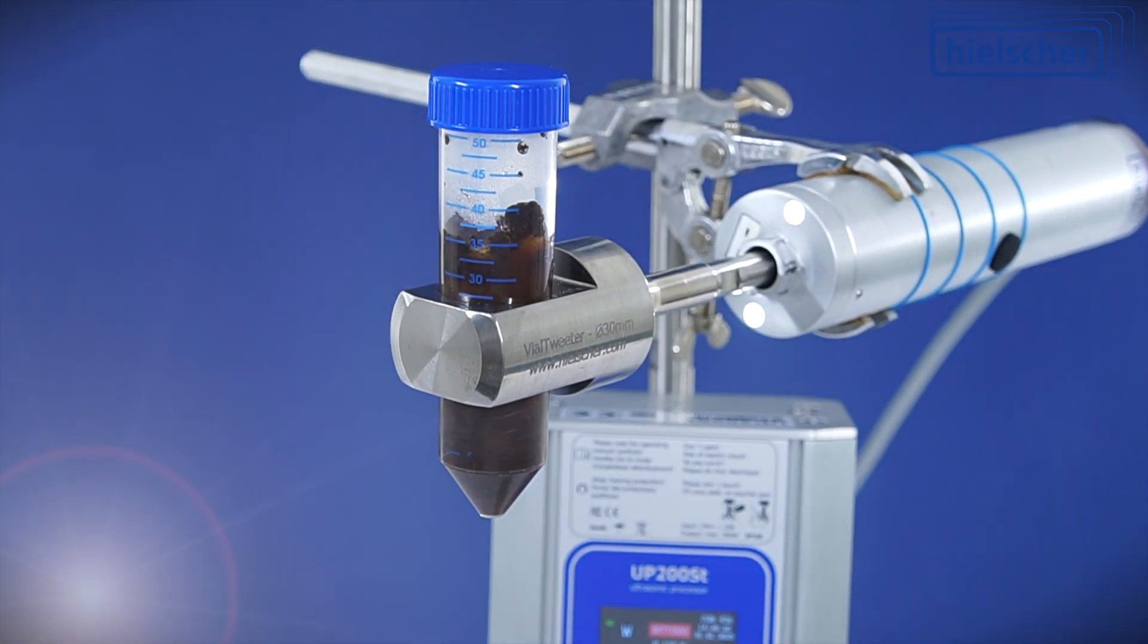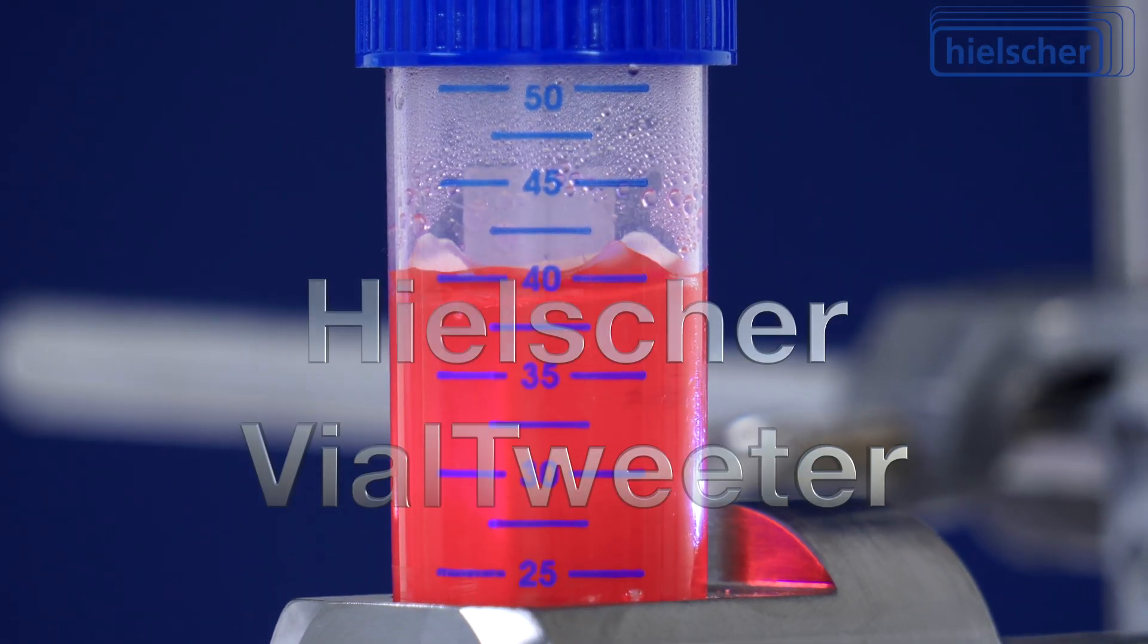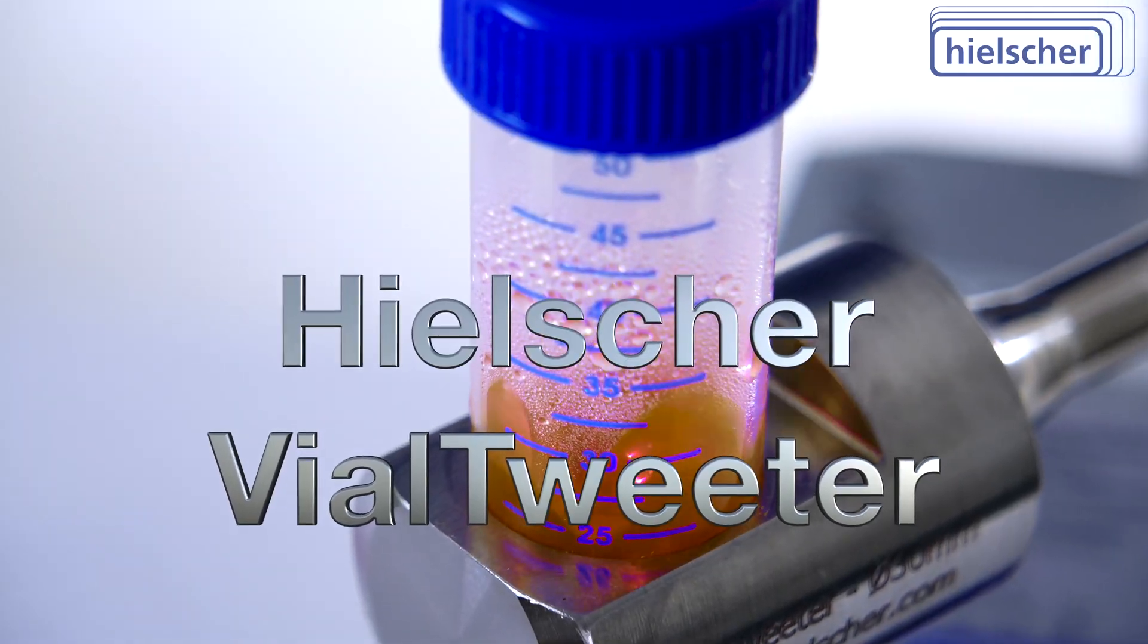In this video, we demonstrate a special version of the Hielscher Vial Tweeter for the sonication of a closed sample vial.